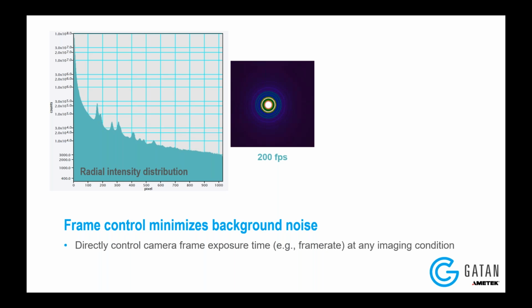And so the idea is, as I mentioned at the start, with a CMOS camera, you're capable of having very, very high frame rates. But if you acquire an image at a high frame rate and integrate a high number of frames, there's a certain amount of noise, readout noise, that's intrinsic to reading out the data of the sensor. And the more frames you integrate, the higher your noise floor will be in the data that you acquire. And this is true for any camera.